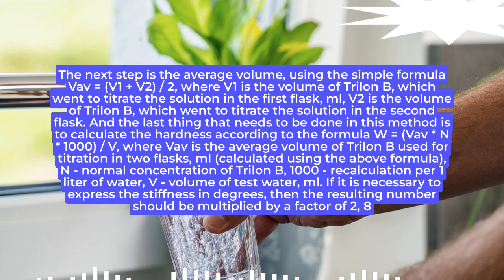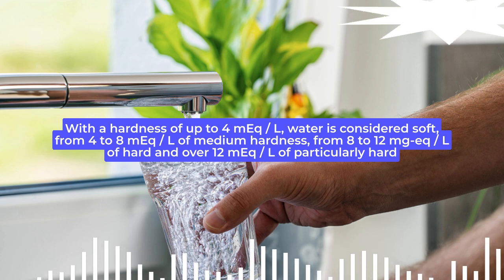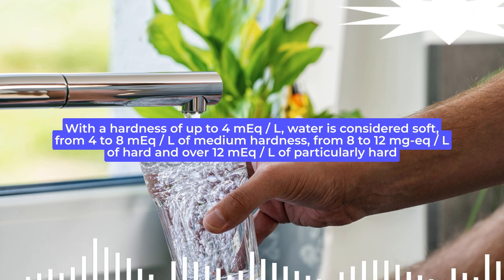of 2.8. Step 5. With a hardness of up to 4 milliequivalent/L, water is considered soft, from 4 to 8 milliequivalent/L of medium hardness, from 8 to 12 meq/L of hard, and over 12 milliequivalent/L of particularly hard.